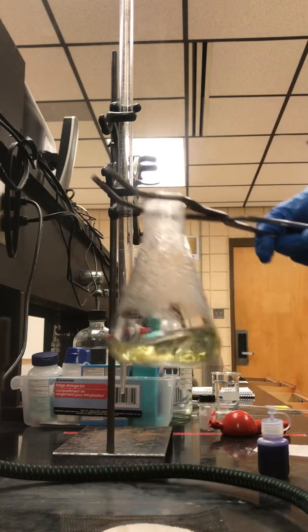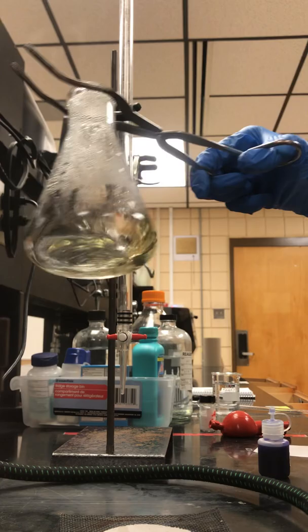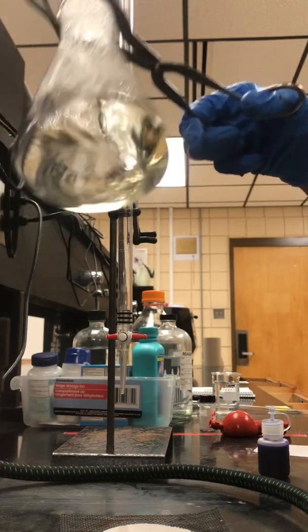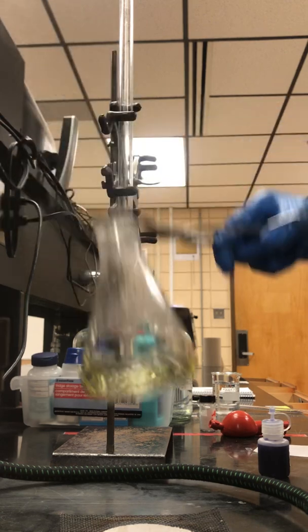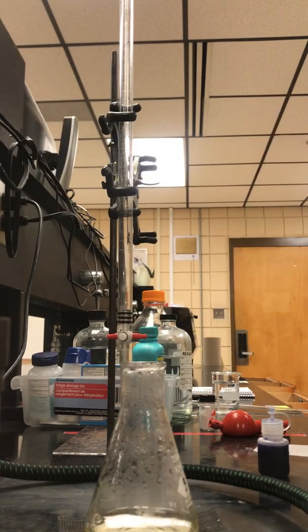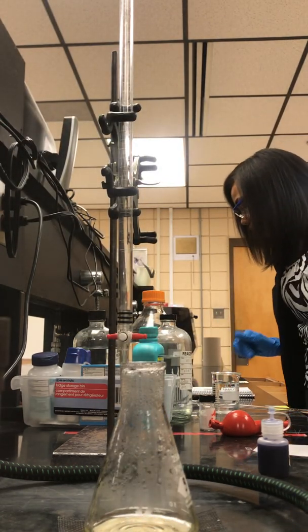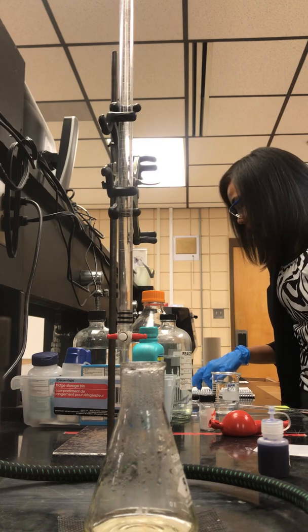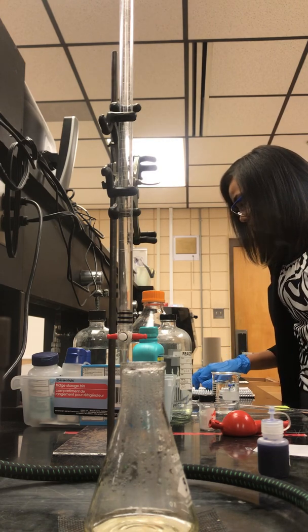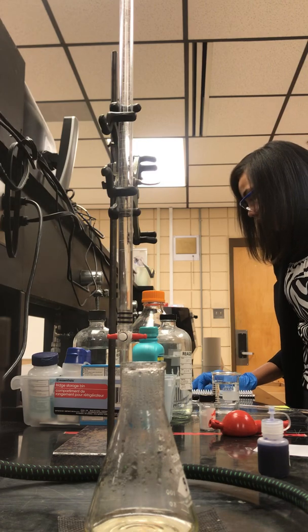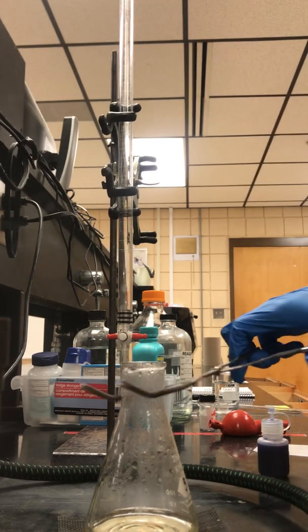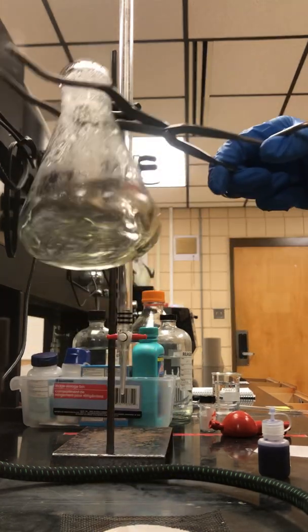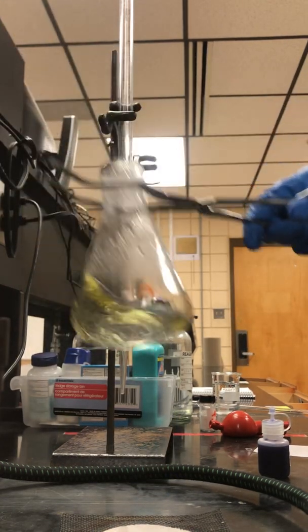I'm going to give that a swirl and you will notice my solution turned yellow. Go back to the directions. It tells you if the solution is blue, pipette an additional 10 milliliters of acid and repeat as often as needed. But ours turned yellow, so we are fine.